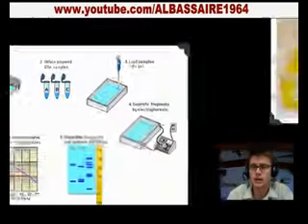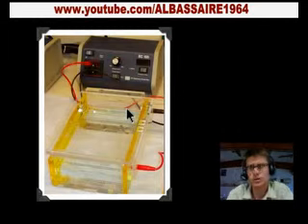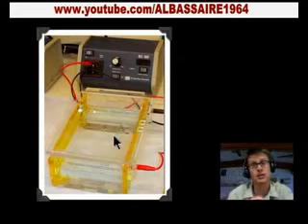And what you get, let's look over here on this gel box, is you'll load the DNA on this side. This is the tricky part, because you want to make sure you don't load it through the gel. But the DNA has a negative charge, so it's going to migrate from the negative side over to the positive side. And depending on when you stop it, we're going to have those fragments at different lengths across the gel.